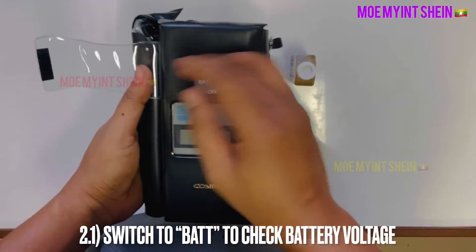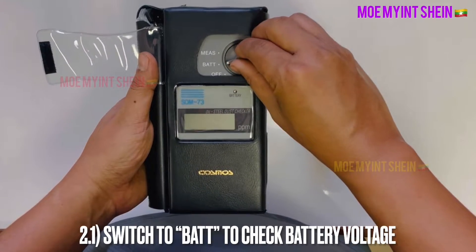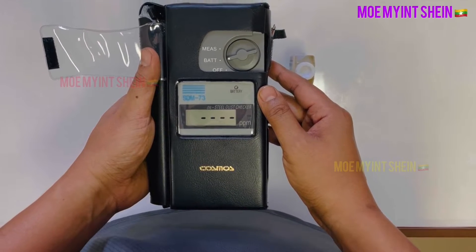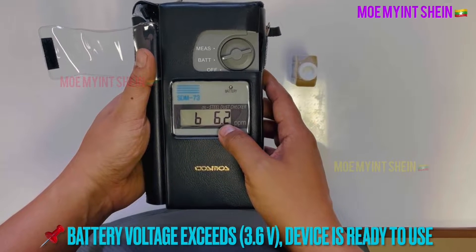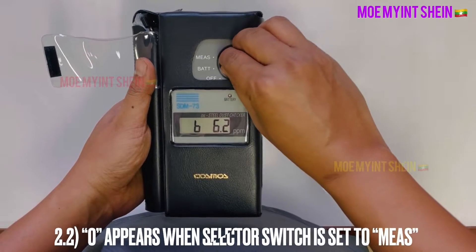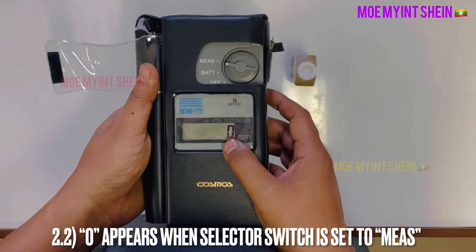Before starting the test, check the condition of the test kit. Set the selector switch to battery and check the voltage. If the battery voltage shows more than 3.6 volts, the device is ready to use. The device must display zero on screen when the selector switch is set to measurement.